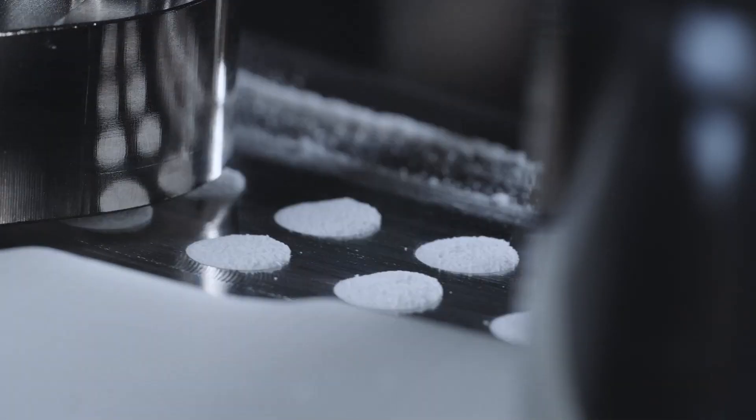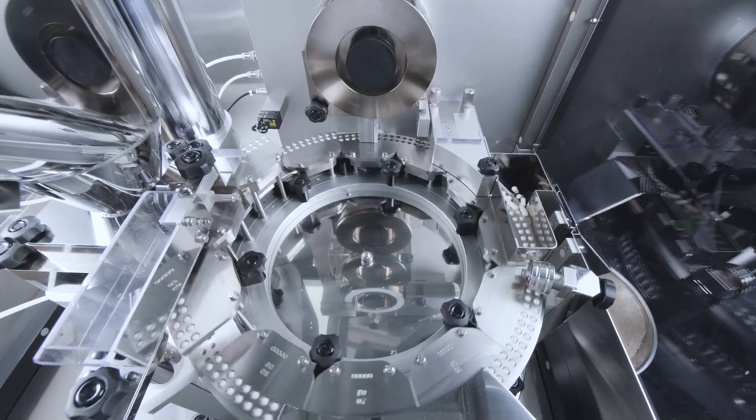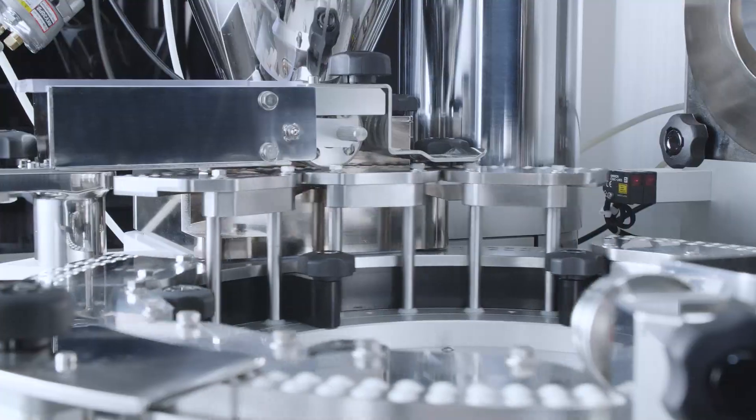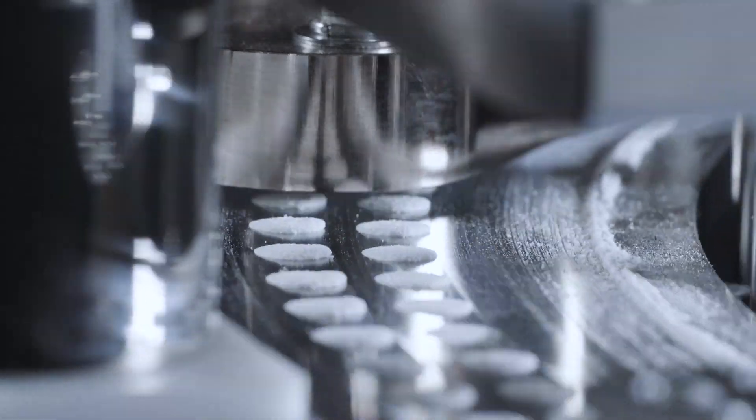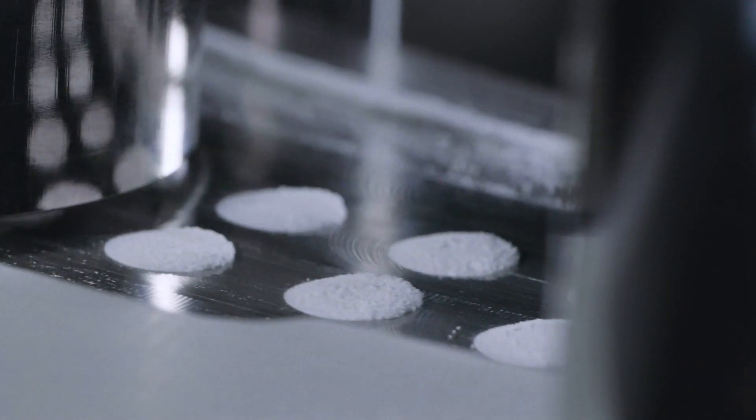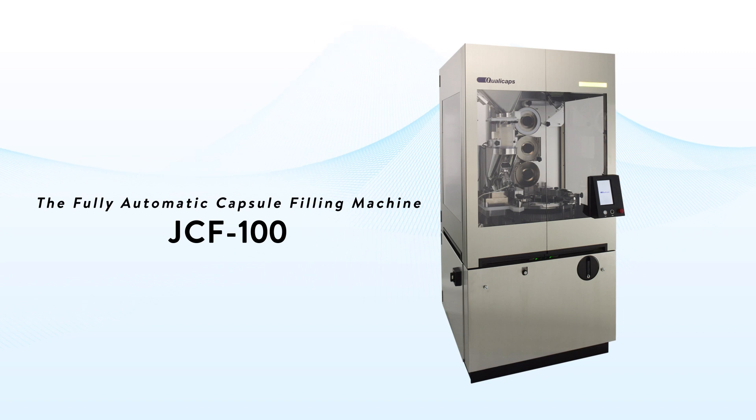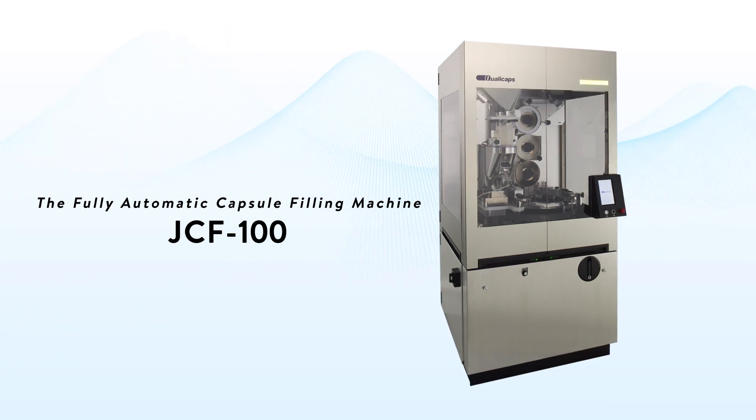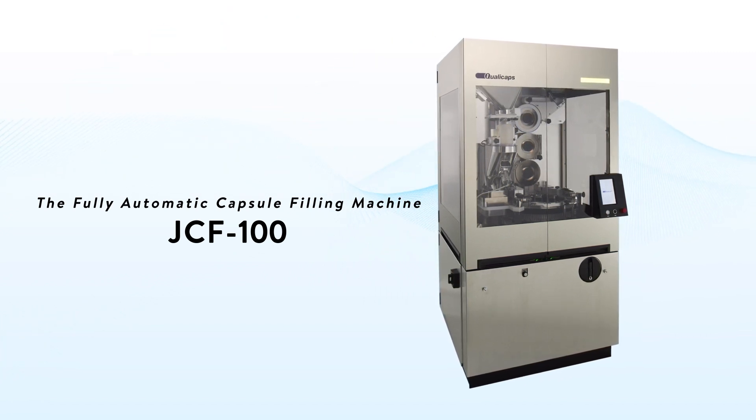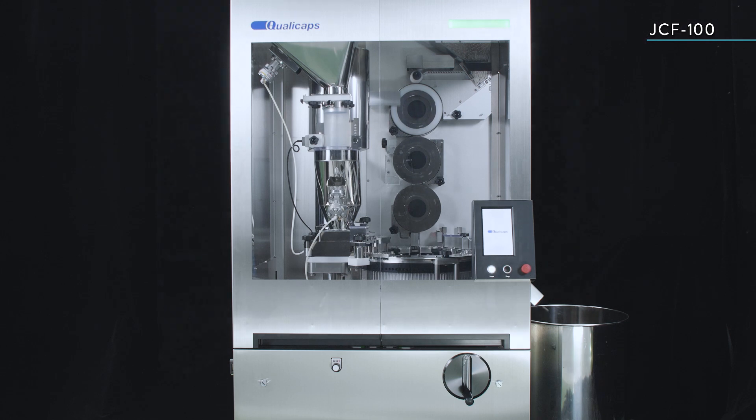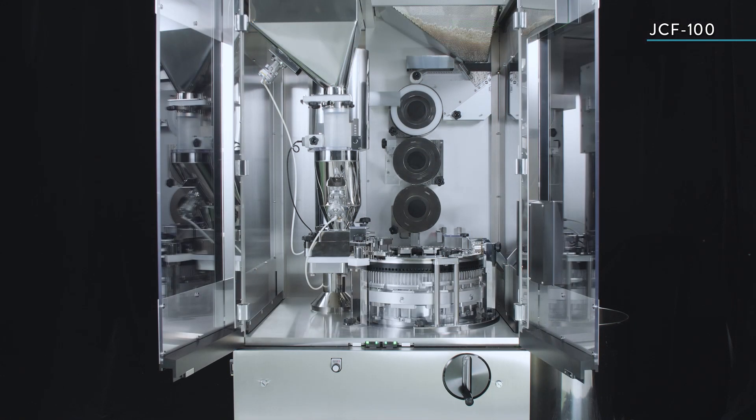Accuracy, speed and stability are required for filling capsules. QualiCaps has developed the fully automatic Auger Capsule Filling Machine, JCF-100, which can handle a wide variety of powders and is capable of stable, high-speed filling. Let's take a look at the JCF-100's filling process.